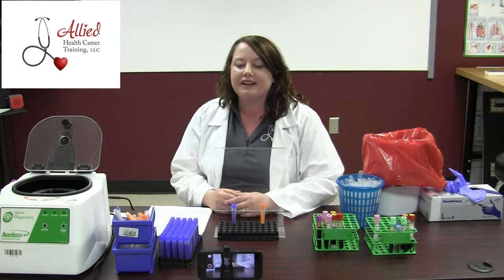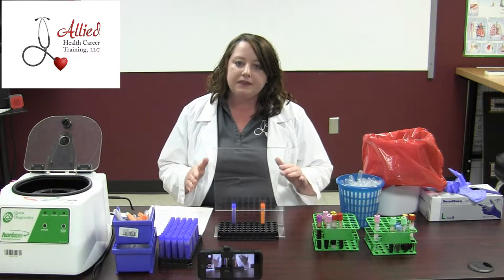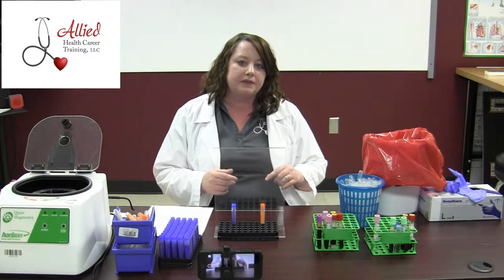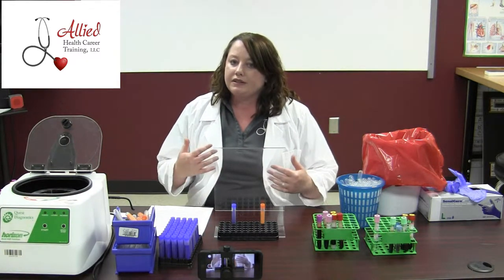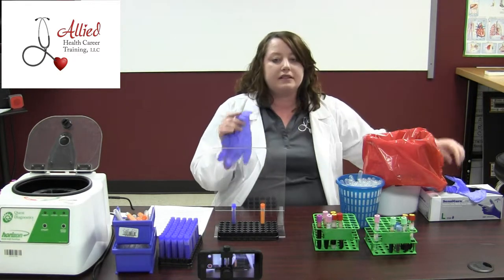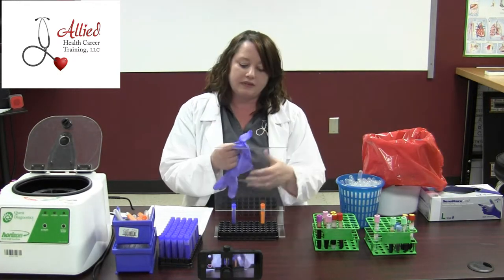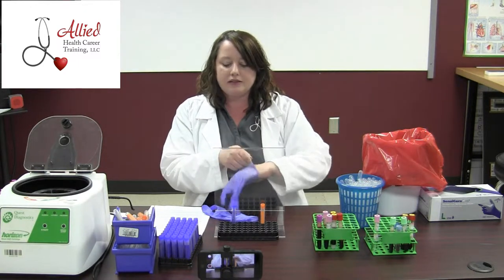Hi, my name is Brandi. I'm with Ally Health Career Training, and today we're going to go over centrifuging and aliquoting. But before we do anything, we definitely want to make sure we get our personal protective equipment on. You typically want to wear a lab jacket or a disposable gown. Always make sure that you don on some gloves anytime you're about to come in contact with any form of blood. Always wear gloves.